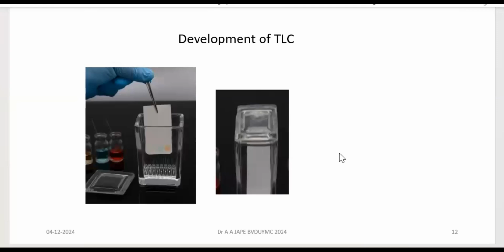Stable not with reference to temperature alone, that is, evaporation of the particular solvent at a given temperature at a faster rate or low rate. However, it should not get oxidized when you are going to allow it to run or when it is prepared. So the stability in terms of chemical stability is also expected.